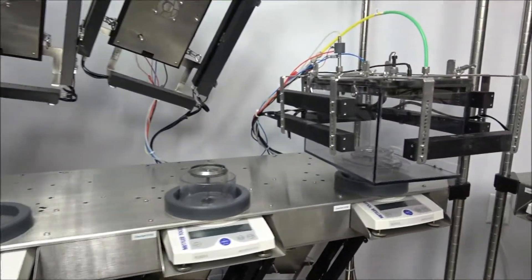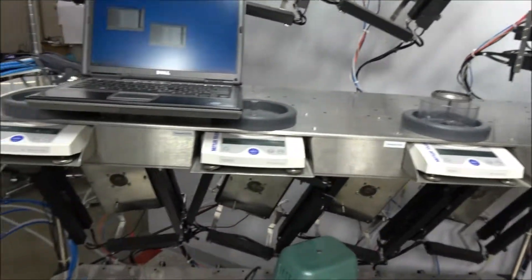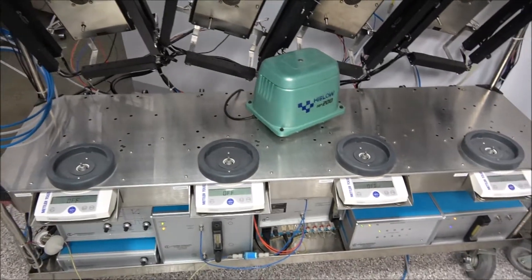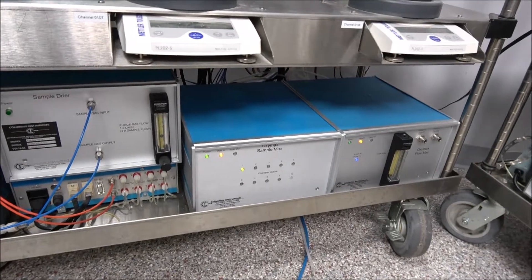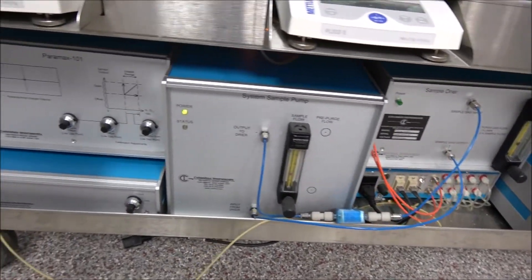The way the system works is we have oxygen sensors as well as carbon dioxide sensors that monitor the consumption and exchange of gases in the cage. There are four racks of eight stations, each requiring animal cages. We do have one center feeding cage that is an example of the equipment.